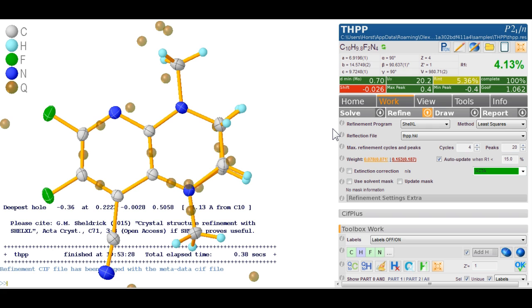Now there was no INS file, there was no copy rest to INS, nothing happened. So all of these things are managed by Olex 2 and the purpose of this video is for you to understand how it all works.